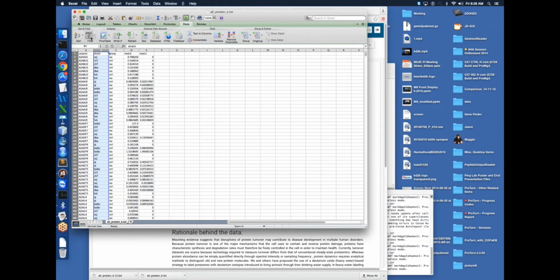The data descriptor there also comes with a metadata file on the experimental conditions, strains, organs and time points. There are certain things, like which protein is in there, that you would need to go to Synapse to find out. But in general, you wouldn't need to do a lot of coding just to find out what data are in there. Most of the descriptions are either in the manuscript or the Synapse project.